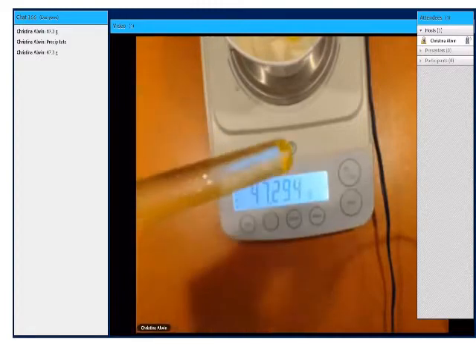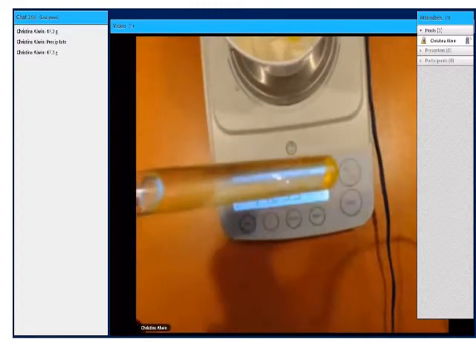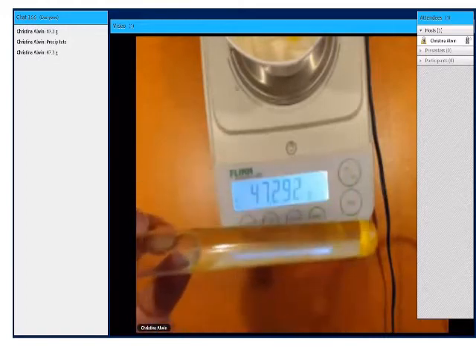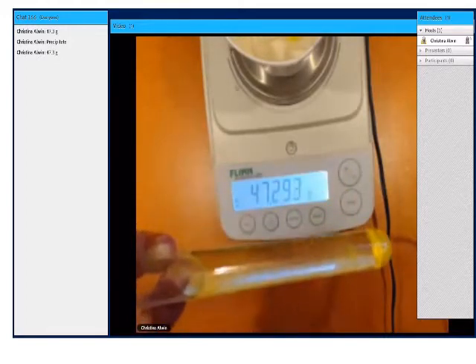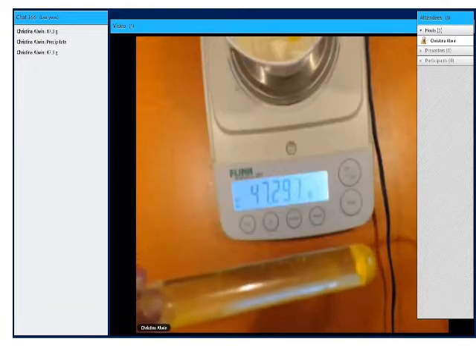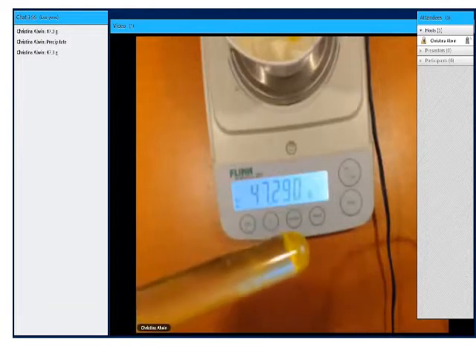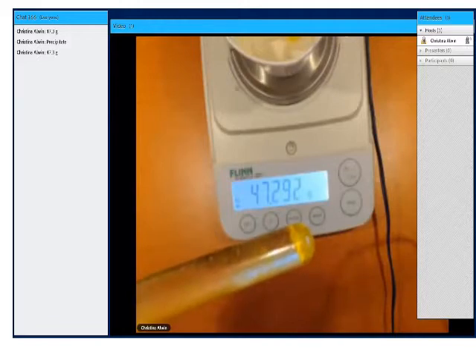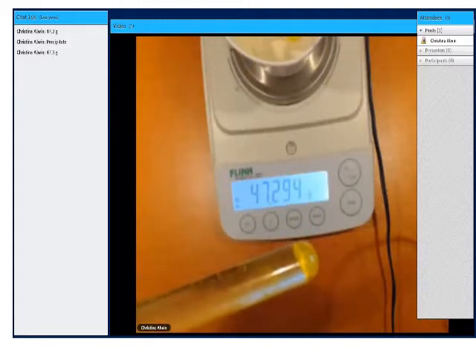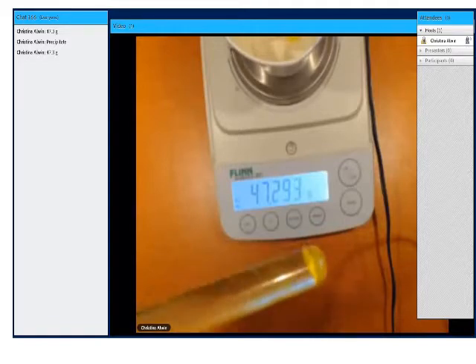I also want to show you this. I've let this one settle out for a while, so now you can really see that there are solid particles floating in. That's a good view of it right there because it's magnifying a little bit. There are solid particles floating in the liquid. And also there's a whole bunch of the solid at the bottom. I just let this set for a little while, and that's what happened. The precipitate settled out to the bottom, showing you that a precipitate formed, which is a solid.